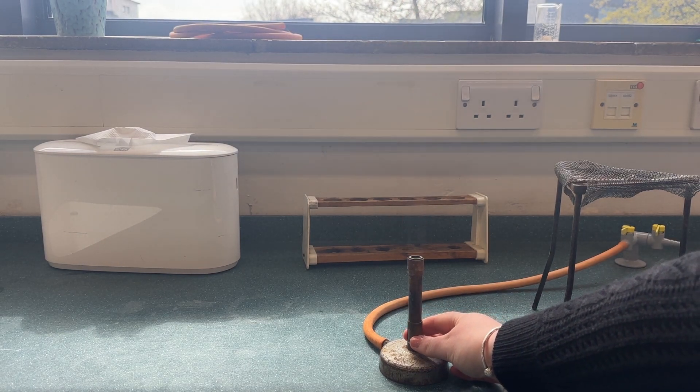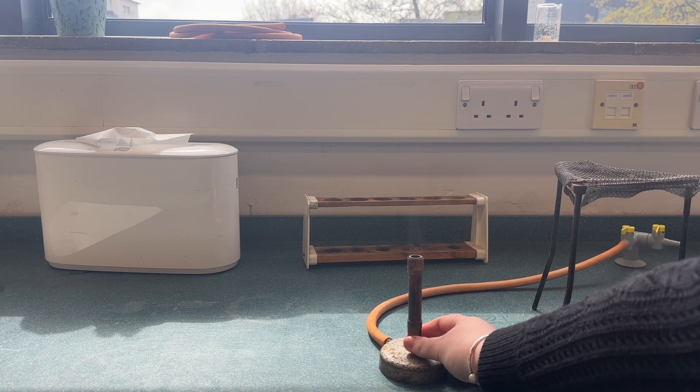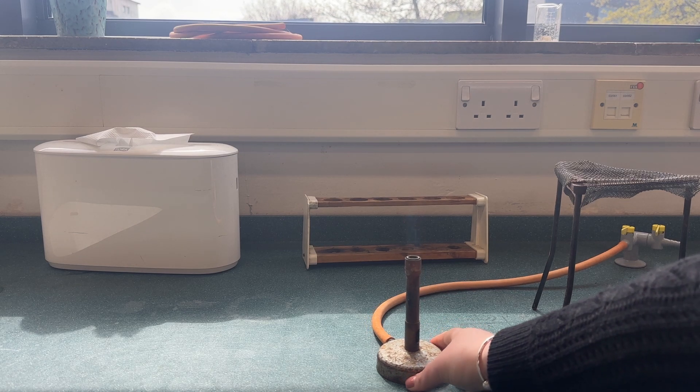The Bunsen burner has three settings. When the air hole is closed this is the safety flame. This is not used to heat anything. This flame does not have much oxygen coming into the hole and is therefore quite sooty.